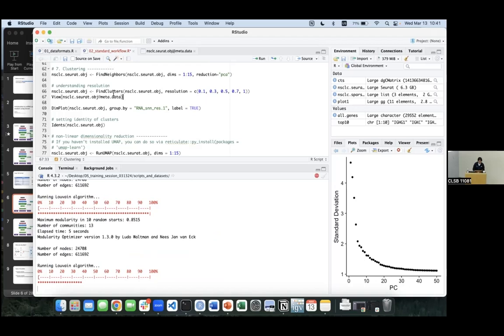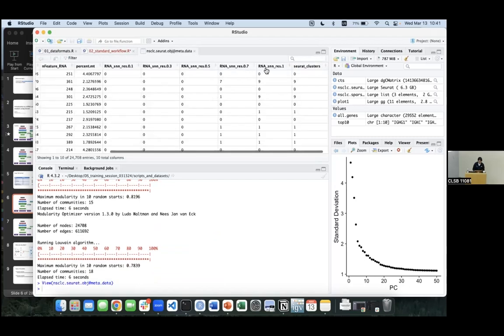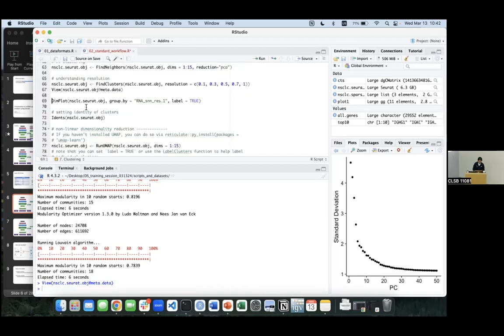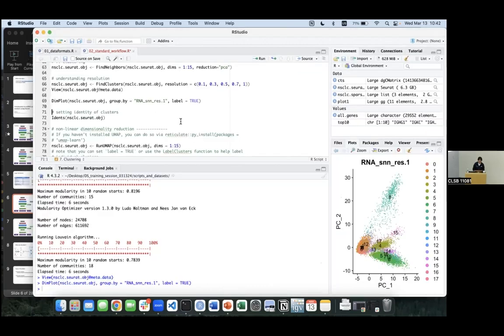So it's gonna show up as 5 new columns in your data, and we can see how it's been shown up here. And in this, each cell's value just means the cluster assignment of different cells to a potential cell type. You can also plot the dimensionality reduction and see how the highest resolution has a lot of clusters assigned together. So we don't want that. And let's see what 0.1 looks like.